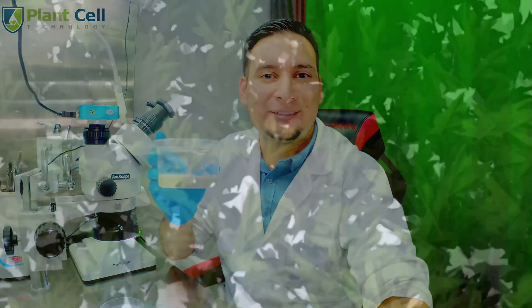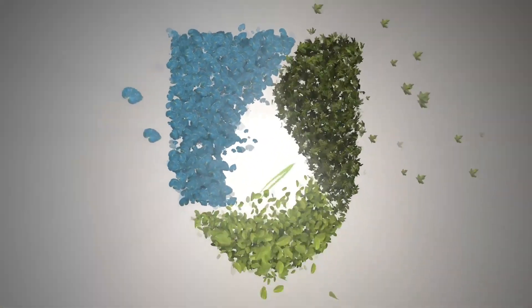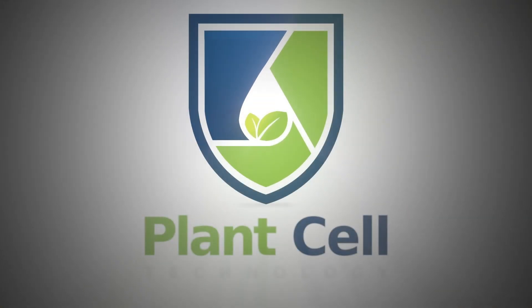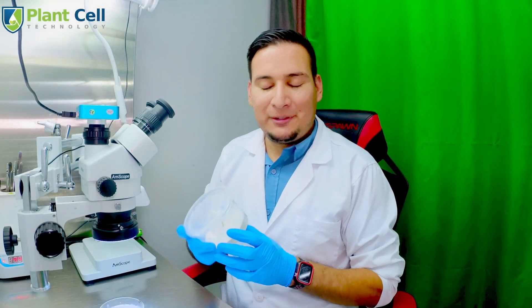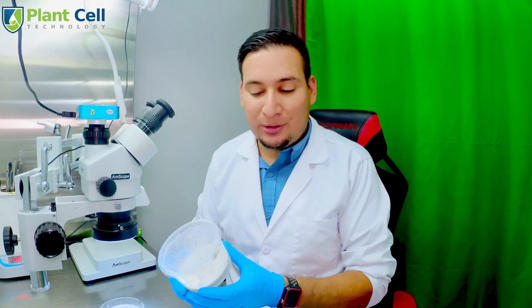Today I will show you how to re-sterilize contaminated tissue culture plants. Welcome back to the channel. Unfortunately my Philodendron pedaratum variegatum got contaminated a couple of days ago and the contamination is quite severe — it's advancing pretty quickly.